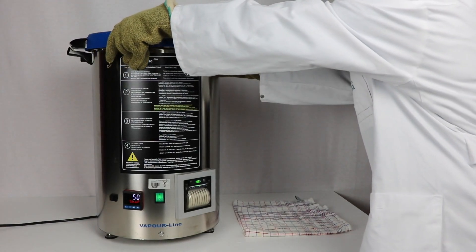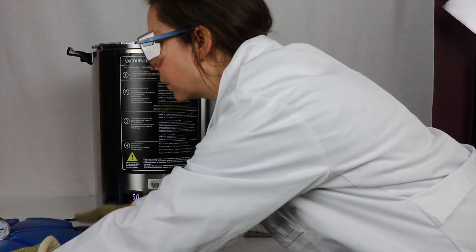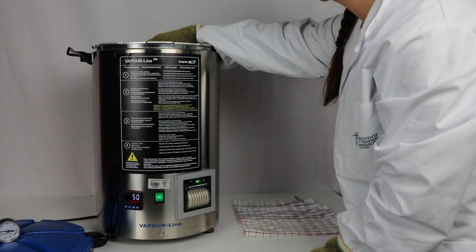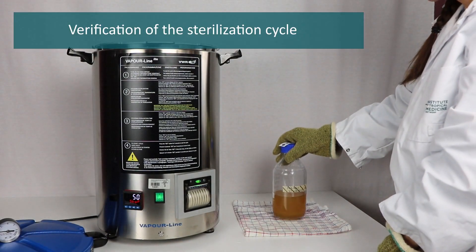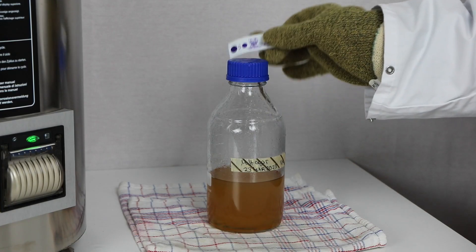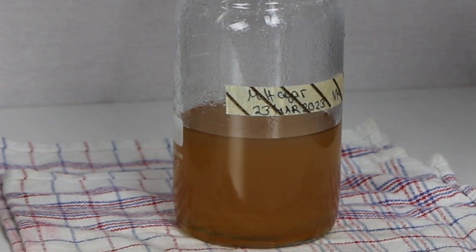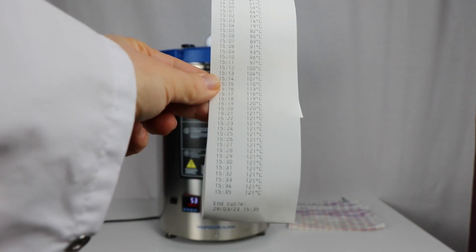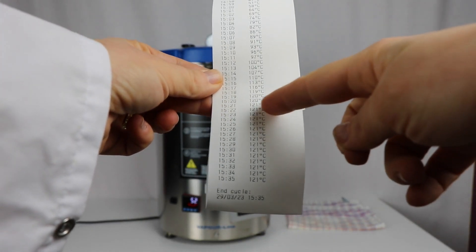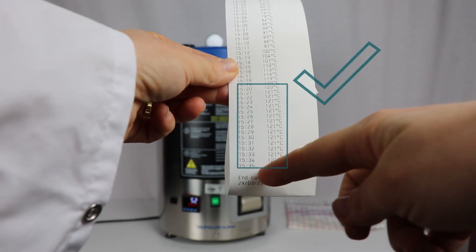Open the cover and take out the sterilized material. Verification of the sterilization cycle: verify the steam sterilization indicators and the steam indicator tape — dark brown or black lines should be visible after autoclaving. Verify the printout of the autoclave. Verify that the correct temperature was maintained for the correct amount of time.